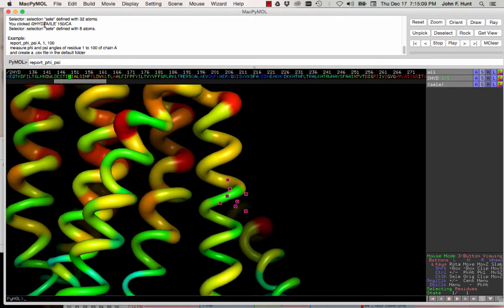Yes, Pymol has told us up here that this is chain A. That's what the A means in that string. If we ask it for the actual residue range, it will not work properly on the Mac. But if we give it a ridiculous residue range of 1 to 1,000, even though there's not a residue 1,000 in this PDB file, it has worked in the past. I hope it works again now when I do this.